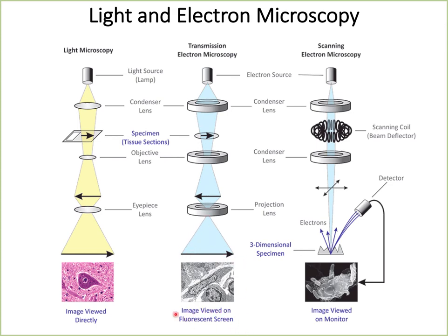But if you have a fluorescent screen, commonly also known as a phosphor screen, at the base, and from here you can visualize through some eyepieces right here. When an electron hits that fluorescent or phosphor screen, it will produce light. This is the same technique that your age-old box televisions used to use.